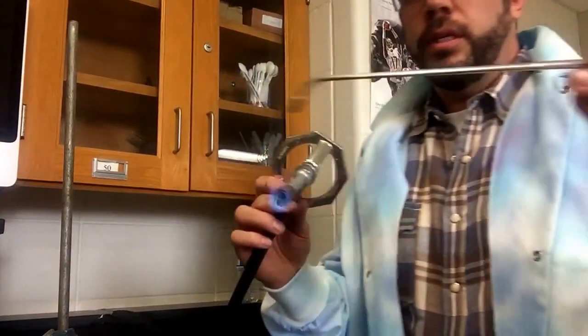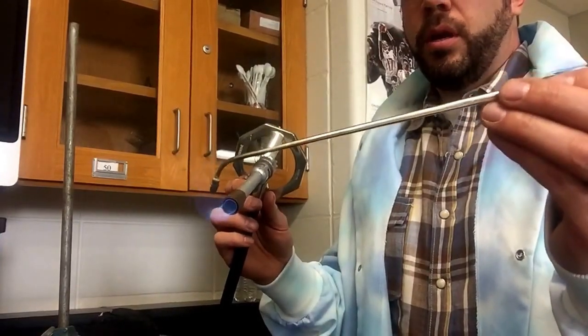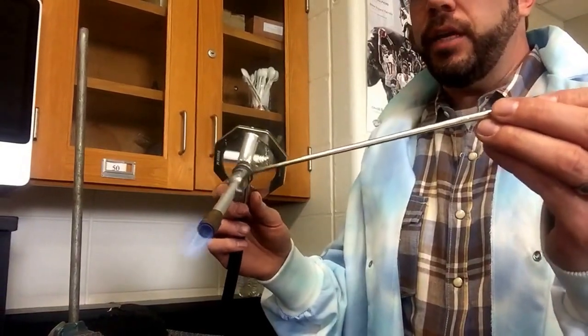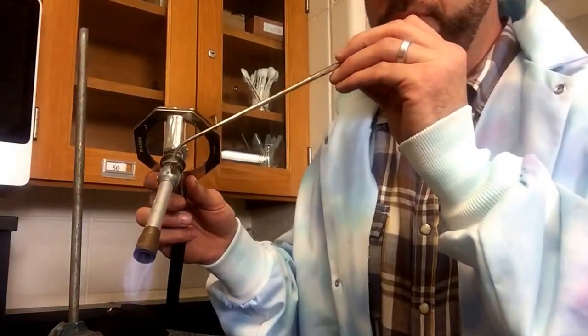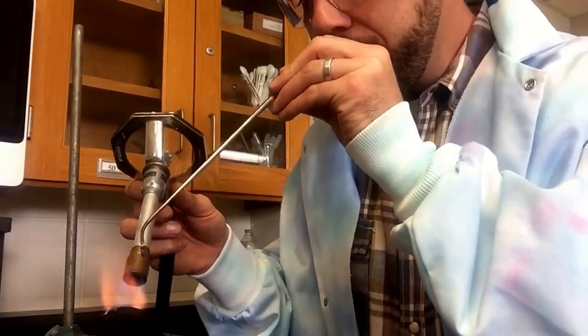The other thing you're going to be using is what we call a blow tube. You want a gentle breeze that you're going to blow — just adding oxygen to the fire to make it a little bit hotter. I'm going to put this at a 45-degree angle and give it a little gentle blowing.